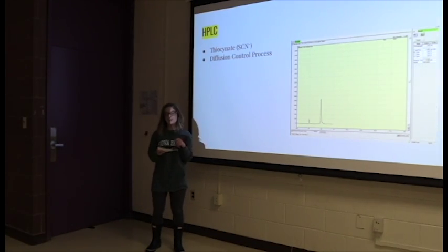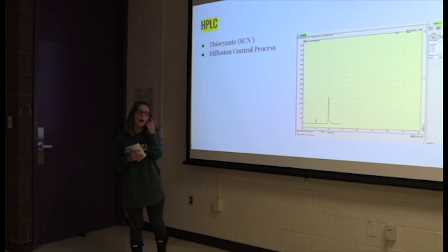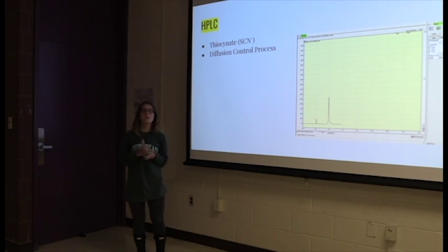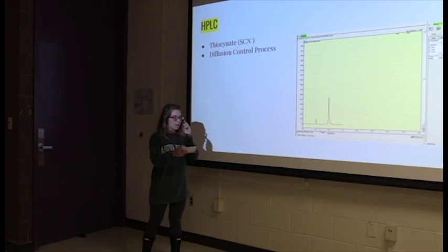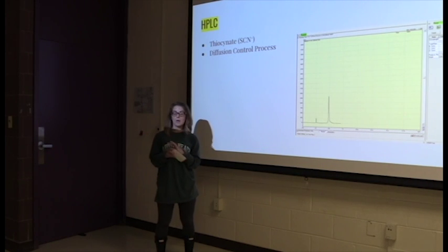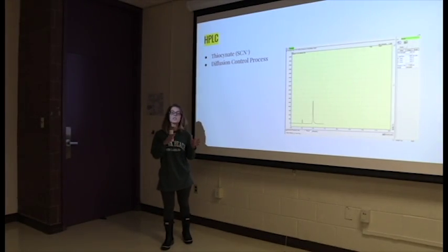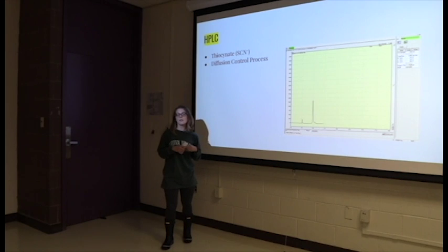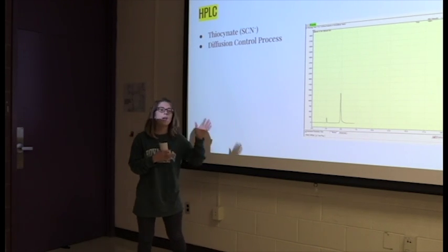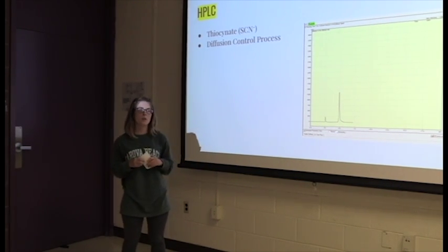So this is thiocyanate. We did a little bit of background research just to find how the ratios would work for iron to curcumin. And so we used thiocyanate as that's a known 1-to-1 ratio with iron 3+. So what happens with the 1-to-1 ratio is that there's a peak at 5 minutes, the intensity is about 850. When you increase the thiocyanate concentration to 1 to 2, that peak goes up to about 900, and then when you increase the ratio further to 1 to 3, the peak actually goes up to 1300, which is why we then use the 1 to 3 ratio for curcumin and iron, and it did prove to support that information.